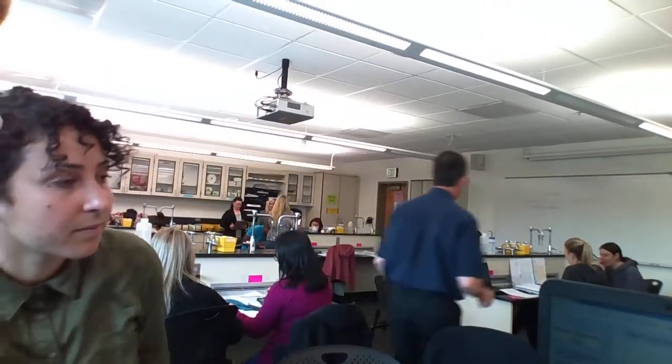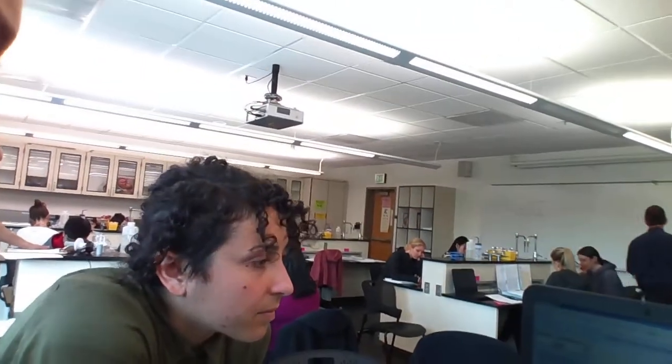Alright, so let's take a look at this graph. We have to turn it. Christie, how do we spin it for baseline? Drop down menu at the top, which is right here. Go down like you just did to lung volume. Click that. Do that button there to make it shift up or down. So about right there.